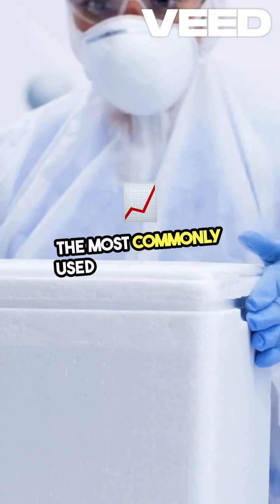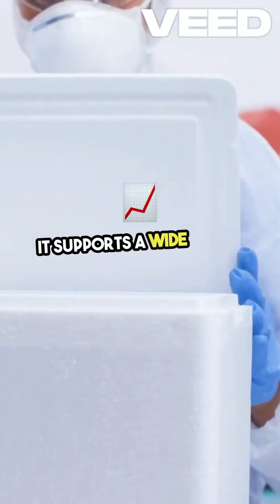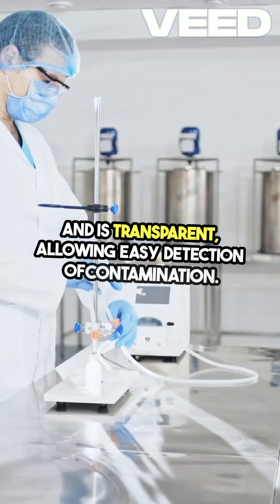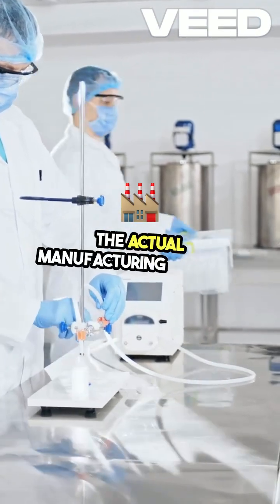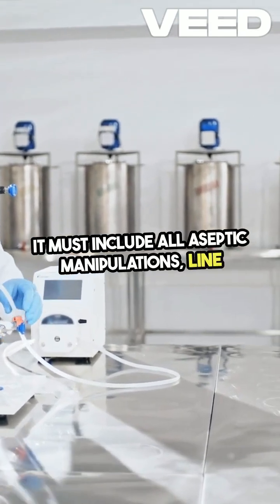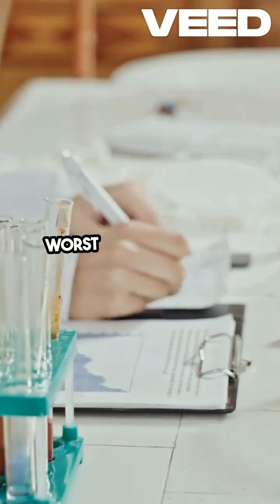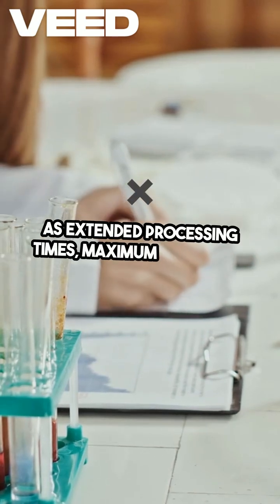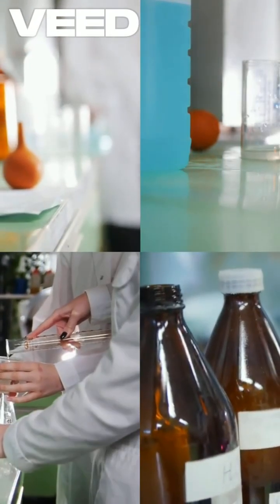The most commonly used growth medium is tryptic soy broth, or TSB. It supports a wide range of microbial growth and is transparent, allowing easy detection of contamination. The simulation should closely mimic the actual manufacturing process. It must include all aseptic manipulations, line setup, vial filling, stoppering, and more. Worst-case conditions must be incorporated, such as extended processing times, maximum personnel involvement, shift changes, and routine interventions.